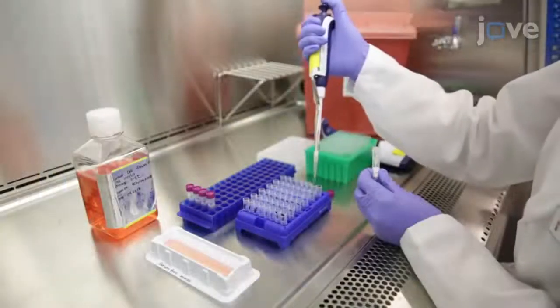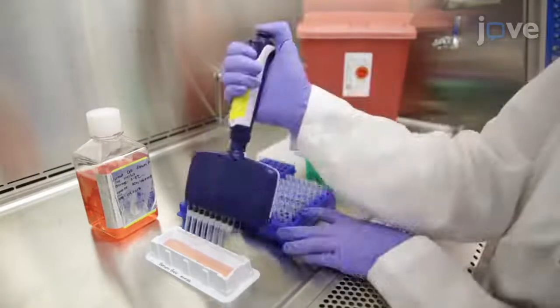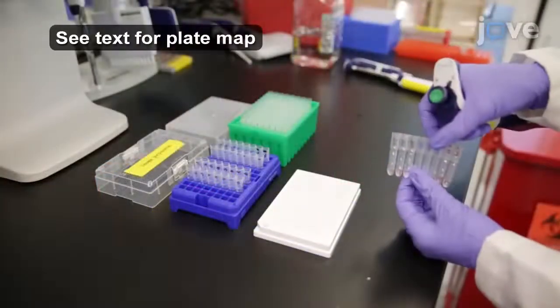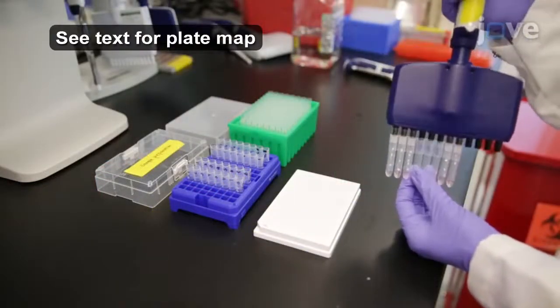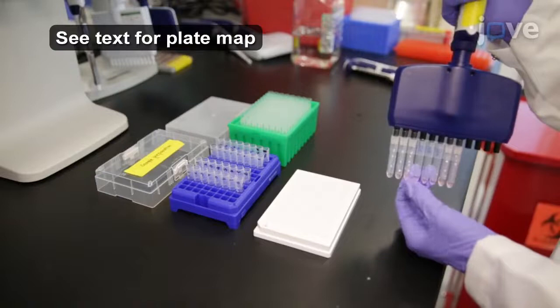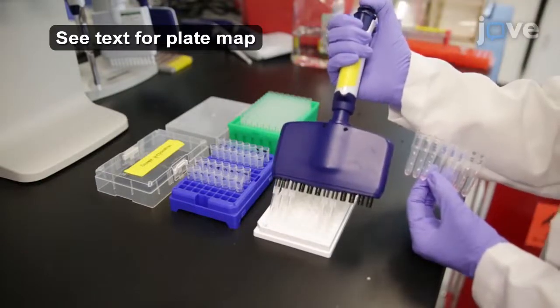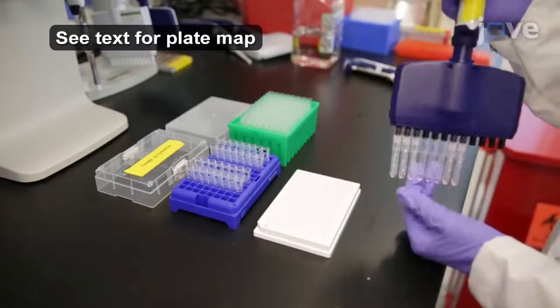Dilute the assay samples in serum-free medium first at a 1 to 2.5 ratio. Then add 60 microliters of each sample to the appropriate wells of a 96-well white, round-bottom non-binding polypropylene plate. This will be the sample incubation plate.